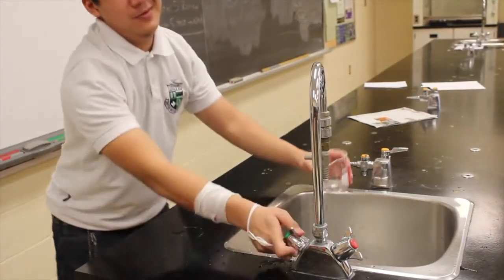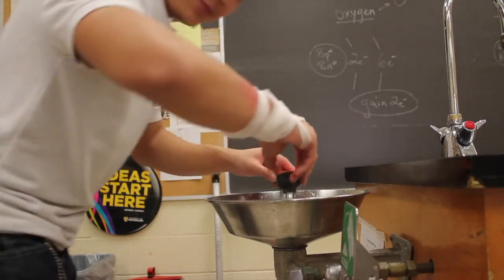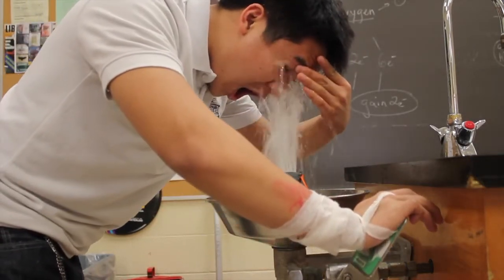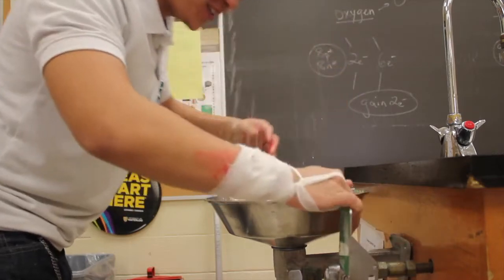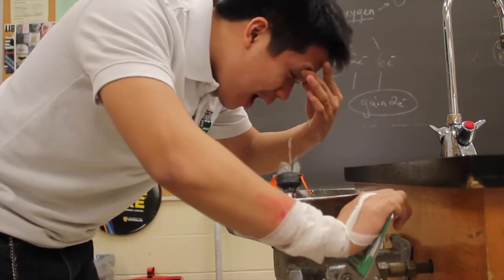When a chemical goes into your eyes, you must go to the eyewash and rinse your eyes out for 15 minutes. When washing your eyes, you must keep your eyes open and moving to ensure that the chemicals wash out. However, if you are wearing contacts, you must remove them after giving them a short rinse. After washing your eyes, you must go to an optometrist to see if any damage has occurred.